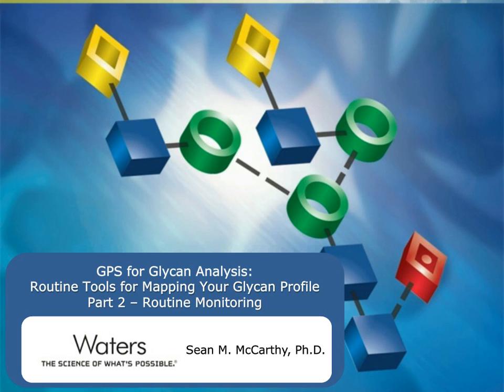And now I want to hand off the presentation to Sean. To begin, as Steve mentioned, I want to focus on some of the applications, in particular focusing on the use of the ACQUITY QDa for doing routine released N-Glycan analysis in conjunction with the RapiFluor-MS reagent.